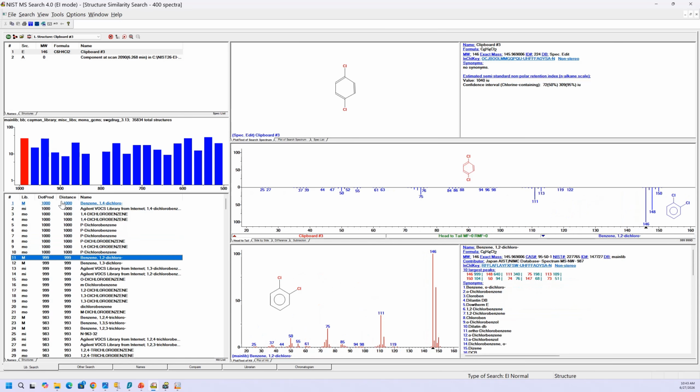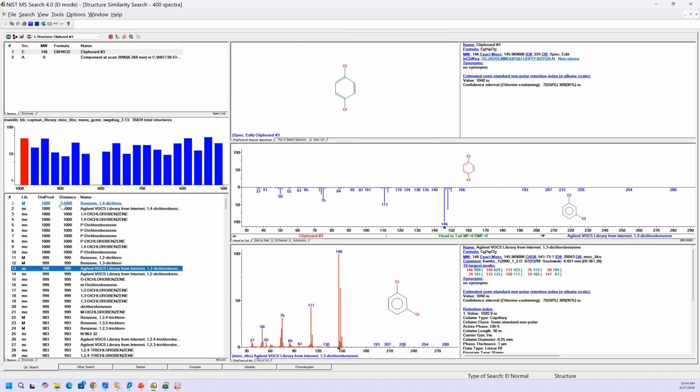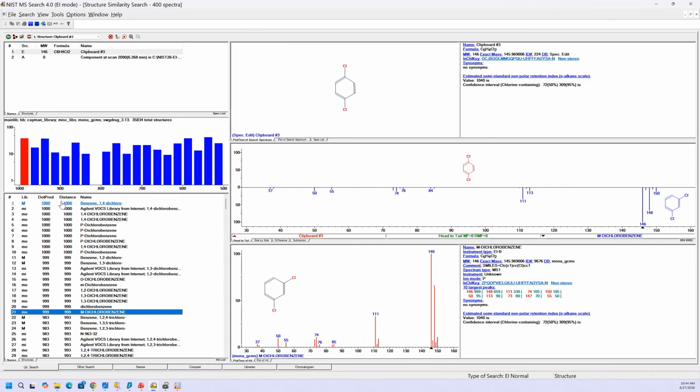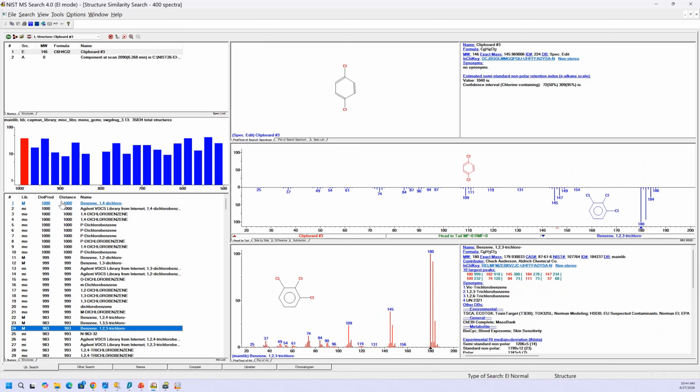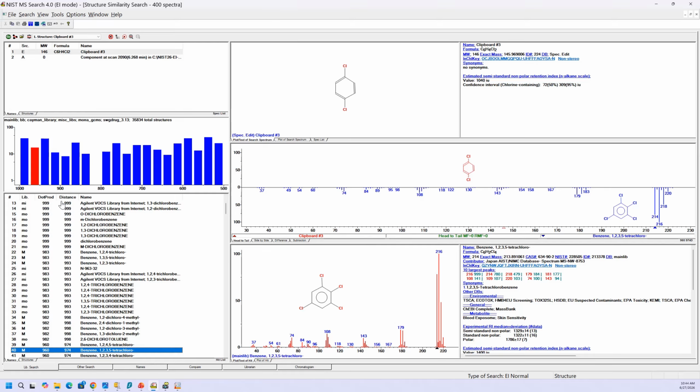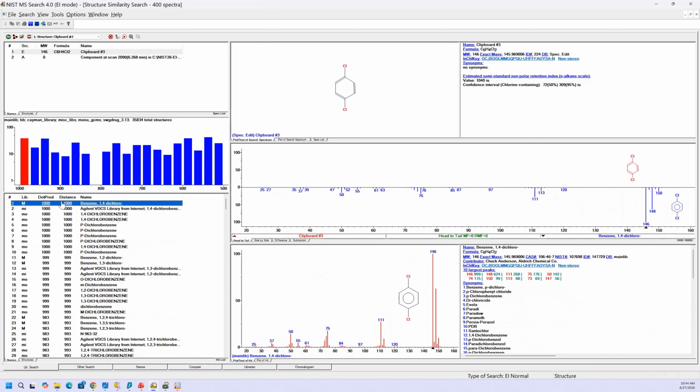And you're getting lots of different spectra for the dichloro, but you're also getting the 1,2-chloro, 1,3. So in a lot of cases, you get a lot of things you don't want. And it's just falling off in the dot product, the fit, trichloro, on further down. It'll have a lot of different things. So that might be useful if you want to see the similar things that fragment. But if you want to see the exact things that fragment, then you need to go with a different approach.